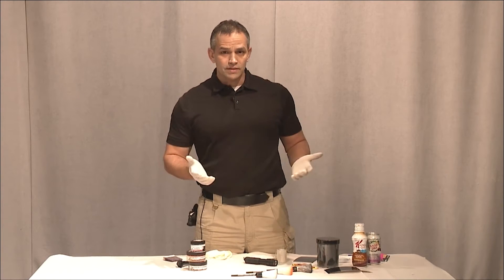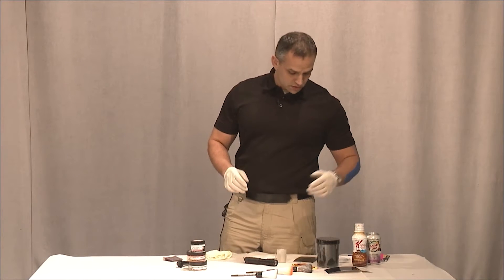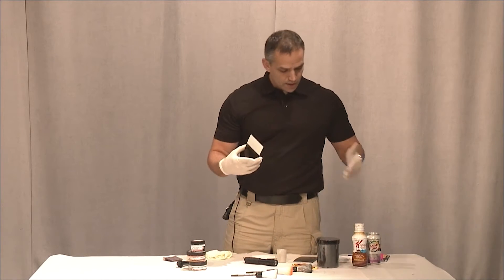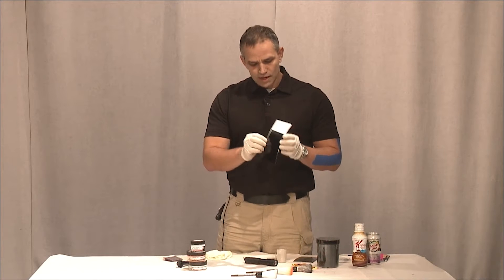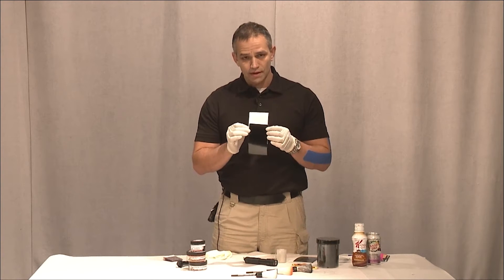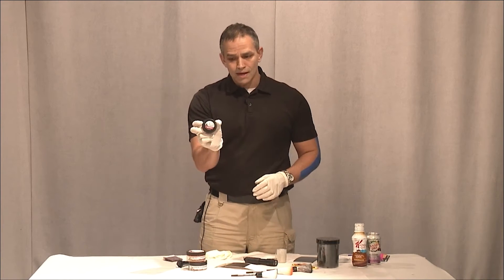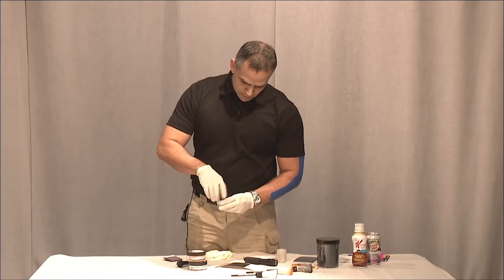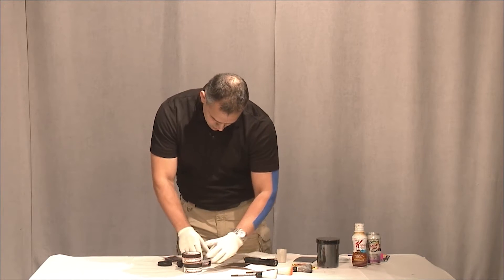It works really well — it works both on black and white color. Let me show you real quick on a card, and then we'll go ahead and try it on some real objects. I have some cards with fingerprints, and the fingerprint is on both — it's on the white and the black. I'm going to use a magnetic powder, and it's a dual-use powder. Let's go ahead with that.